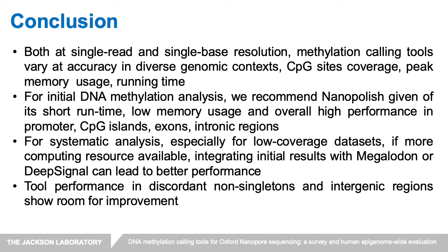For a systematic analysis, especially for low coverage data sets, it will be more accurate to integrate Nanopolish with Megalodon or DeepSignal if more computational resources are available. Also, the poor performance in discordant non-singletons and intergenic regions showed potential improvement for tool developers.